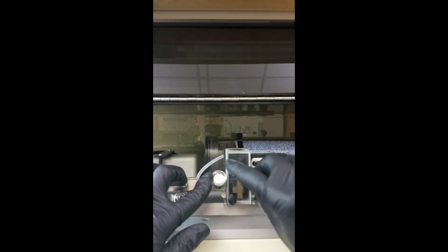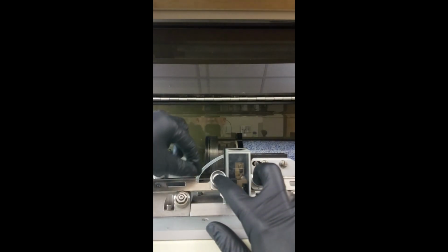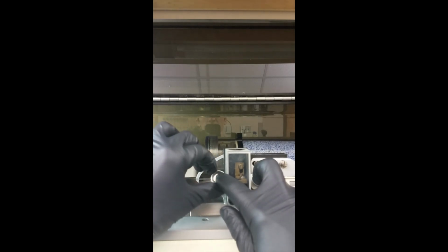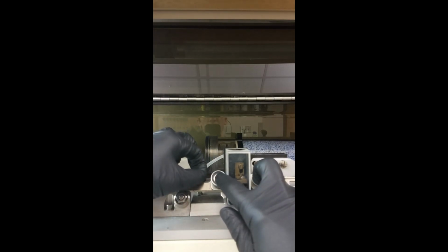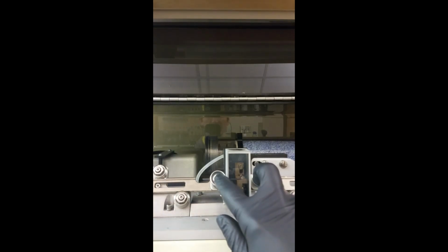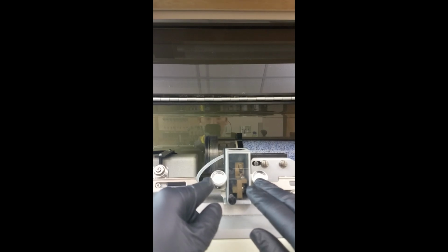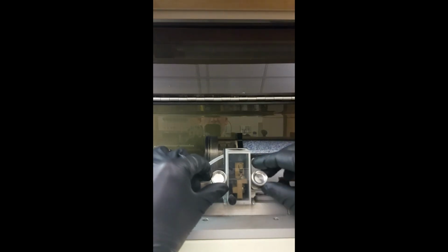So you slide this over. You also slide the other side over. It also has that same lock. Hold both of those, and then continue to push the tube. Make sure it stays in its track. I'm going to tighten that a little bit more. Push the tube until it's about equal on both sides. So there's just a little bit of overhang, maybe a little less than a centimeter on both sides here. Then you tighten down both sides until it's just snug, just so it stays.